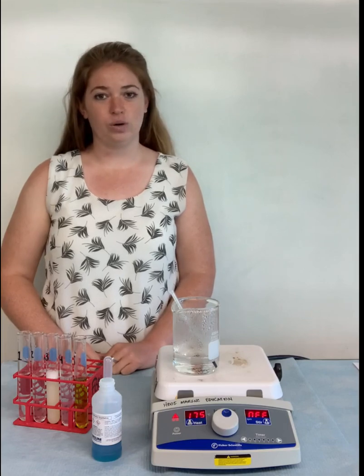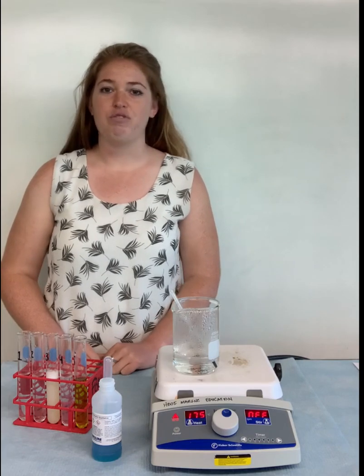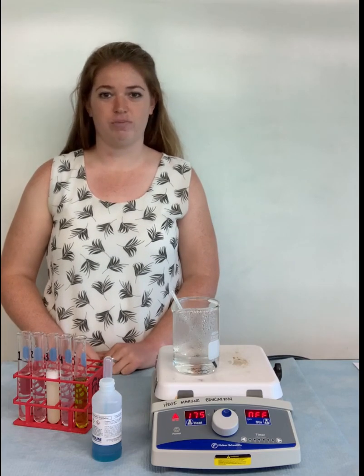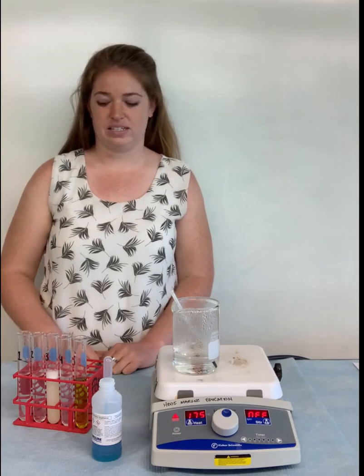Specifically, if we have a low concentration of monosaccharides in our solution, we will see a yellow or green color change. If we have a high concentration of monosaccharides in our solution, we will see an orange or red color change. So let's go through all the solutions that we're going to be testing today.